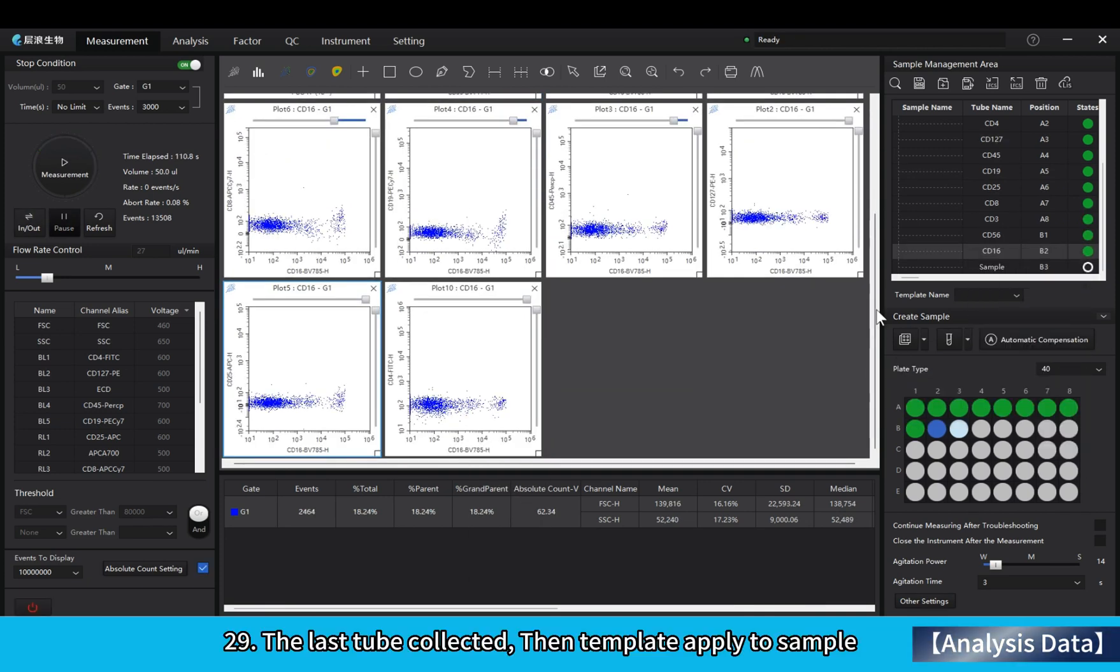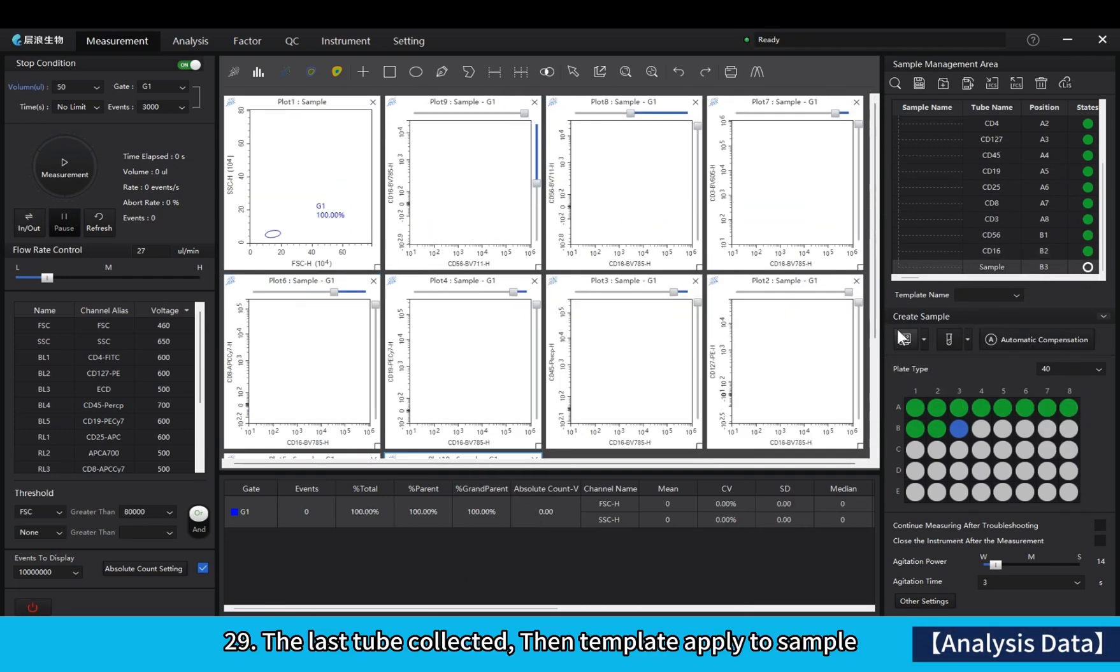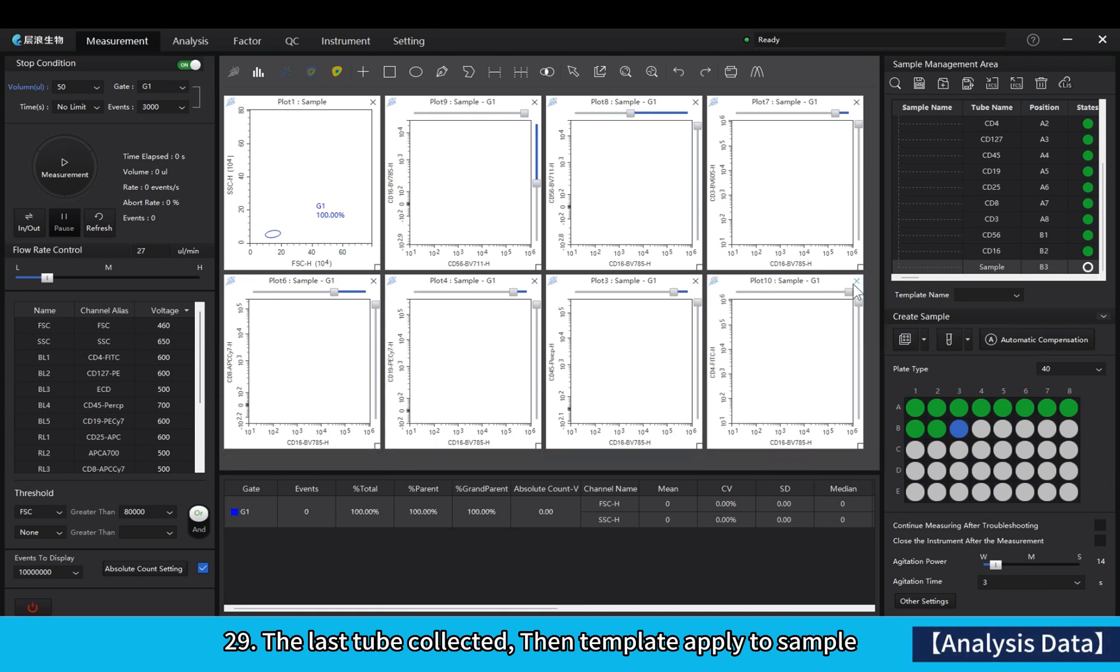The last tube collected. Then template applied to sample.